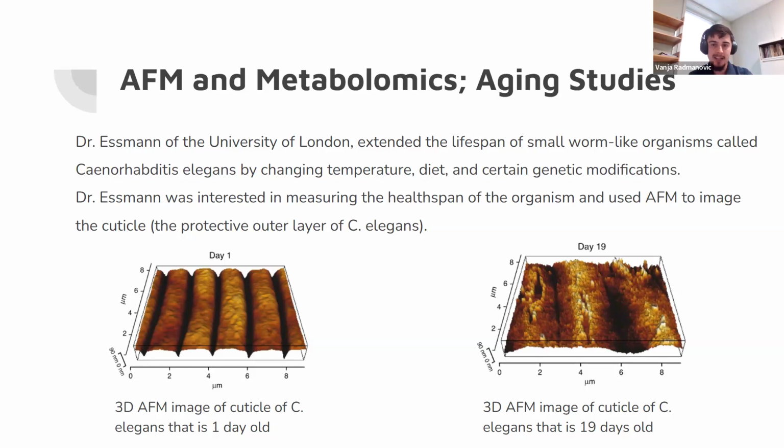They used AFM in two ways to determine health span. The first way was through force spectroscopy, to push very hard down on its outer layer and then pull back up to see its reaction to deforming and then returning to its shape, to see the hardness and stiffness of the microorganism's skin. I didn't include that data because it's mainly just force curves and it's not super interesting. But the second way they used AFM to measure the health span of the organism was to image the topography of its outer layer, to see what its outer layer of skin looks like.